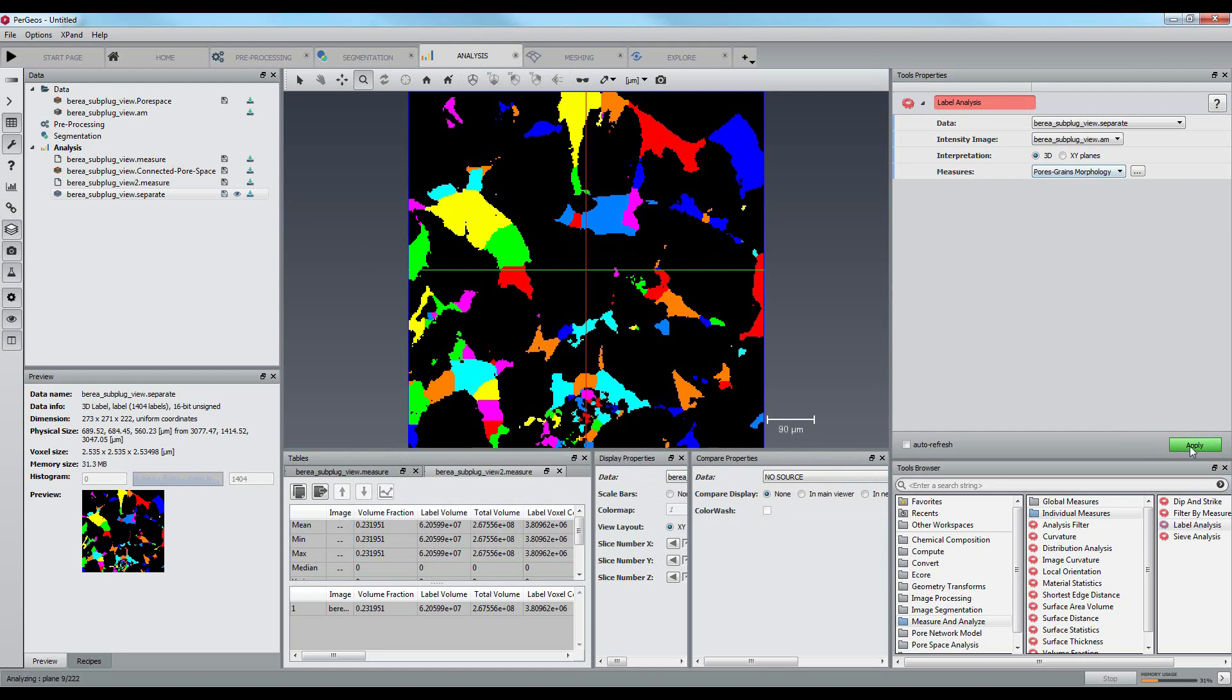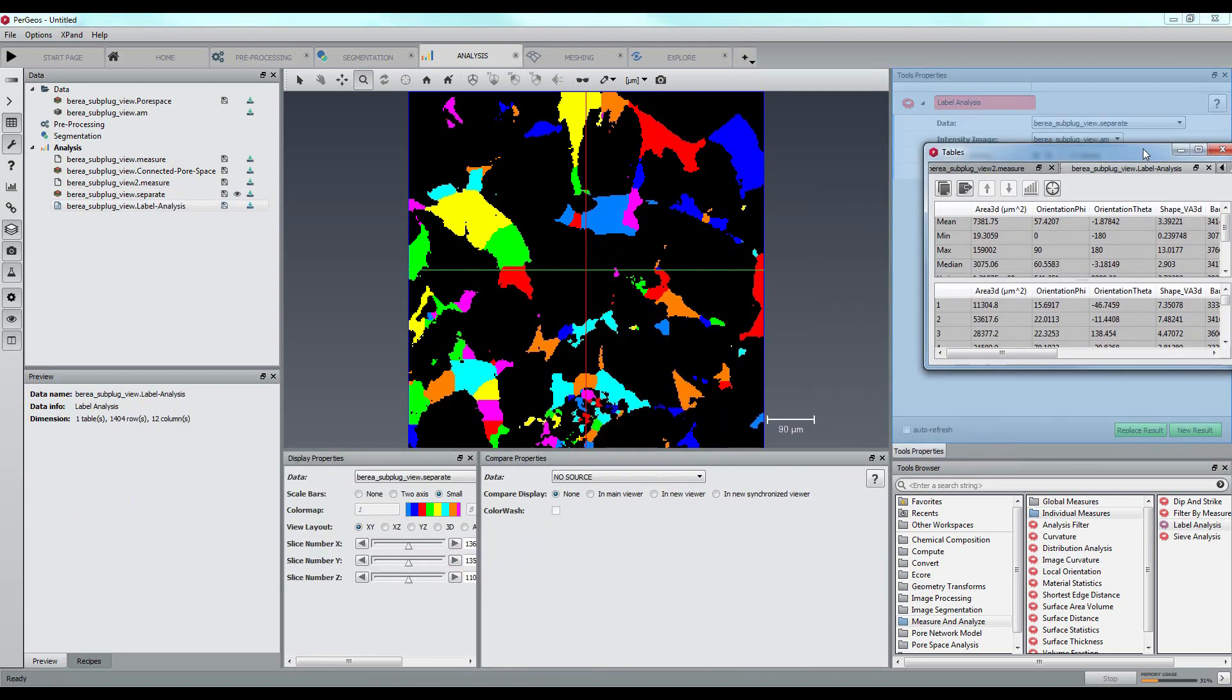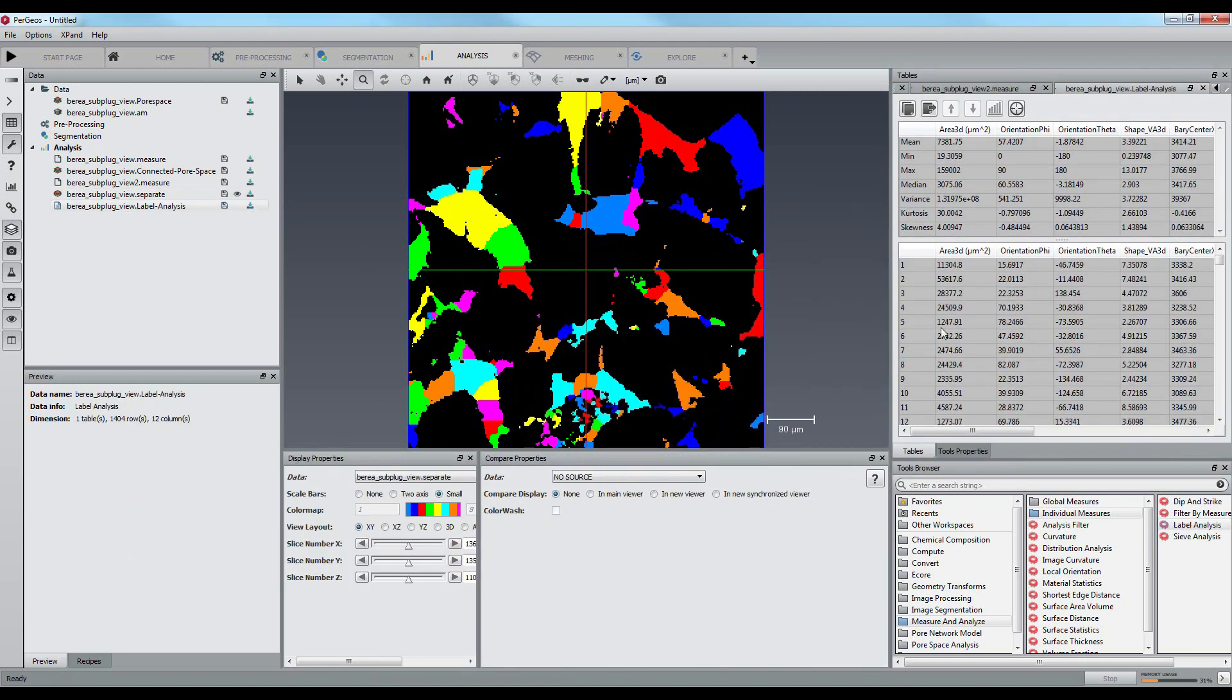Every single pore is now characterized with the 3D area, orientation, sphericity, etc.